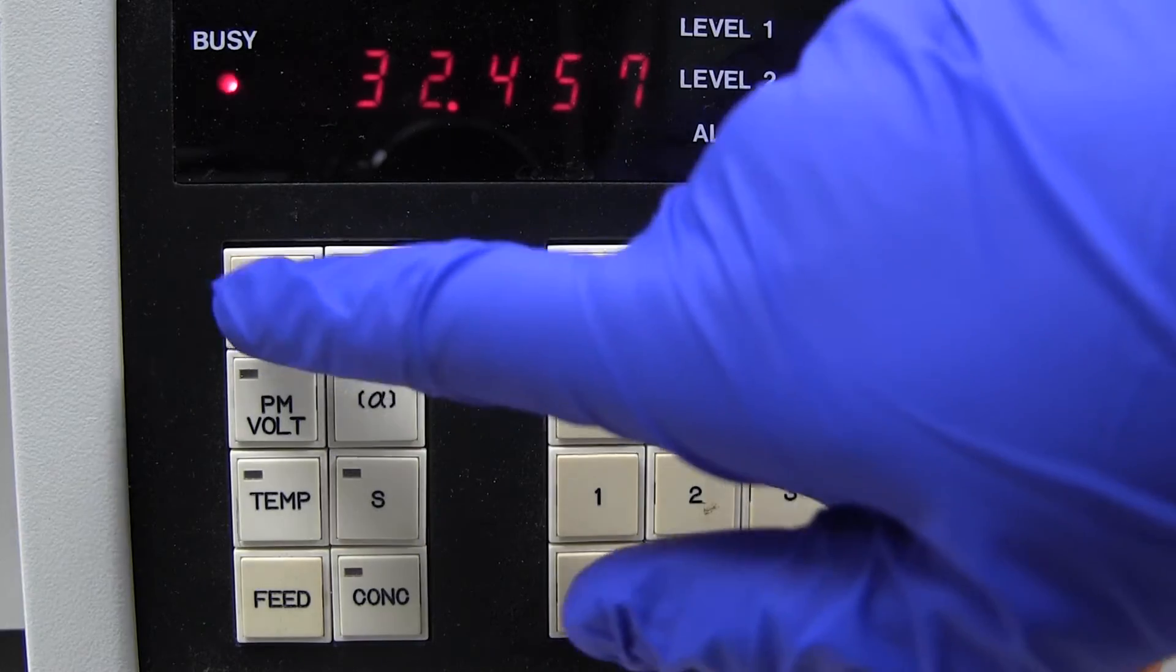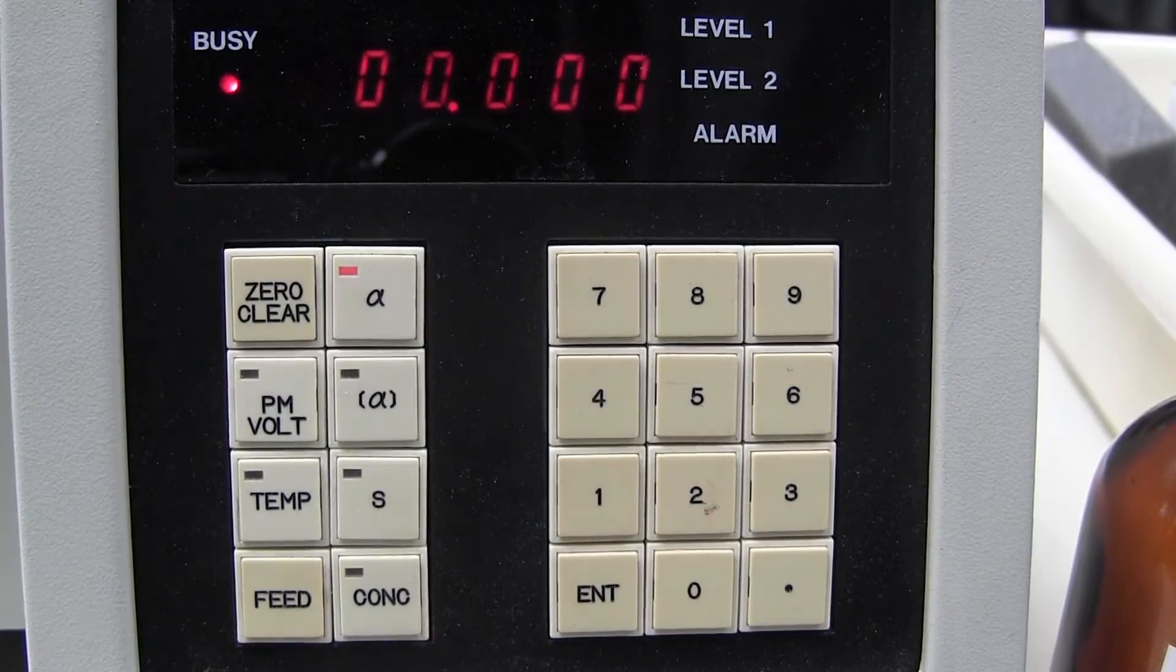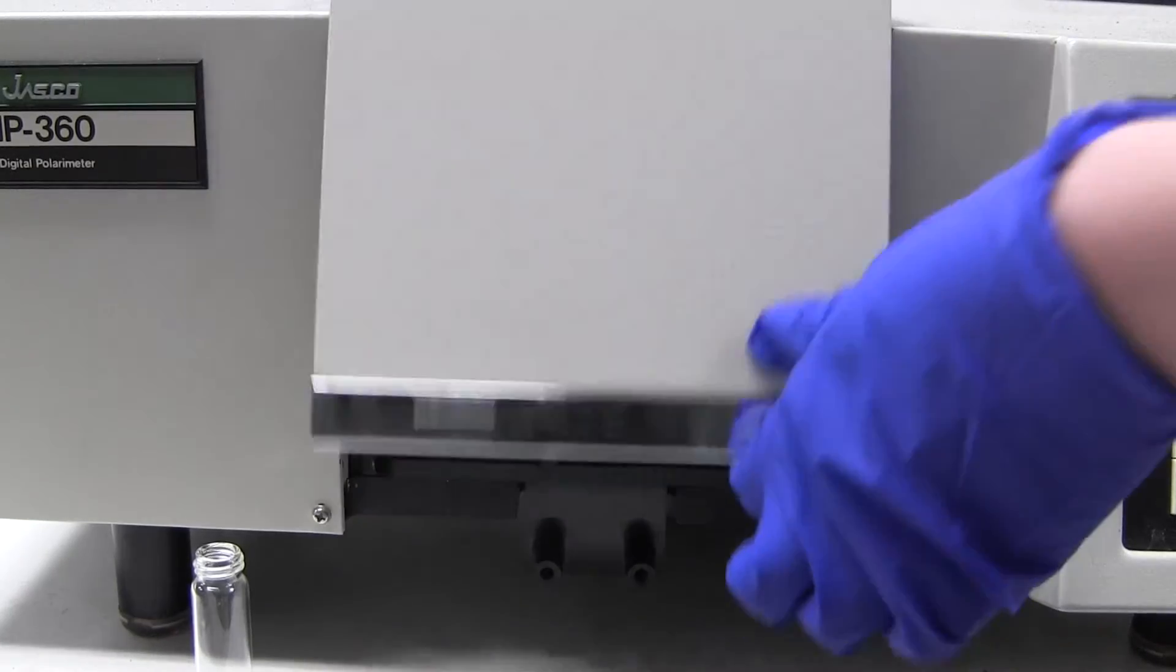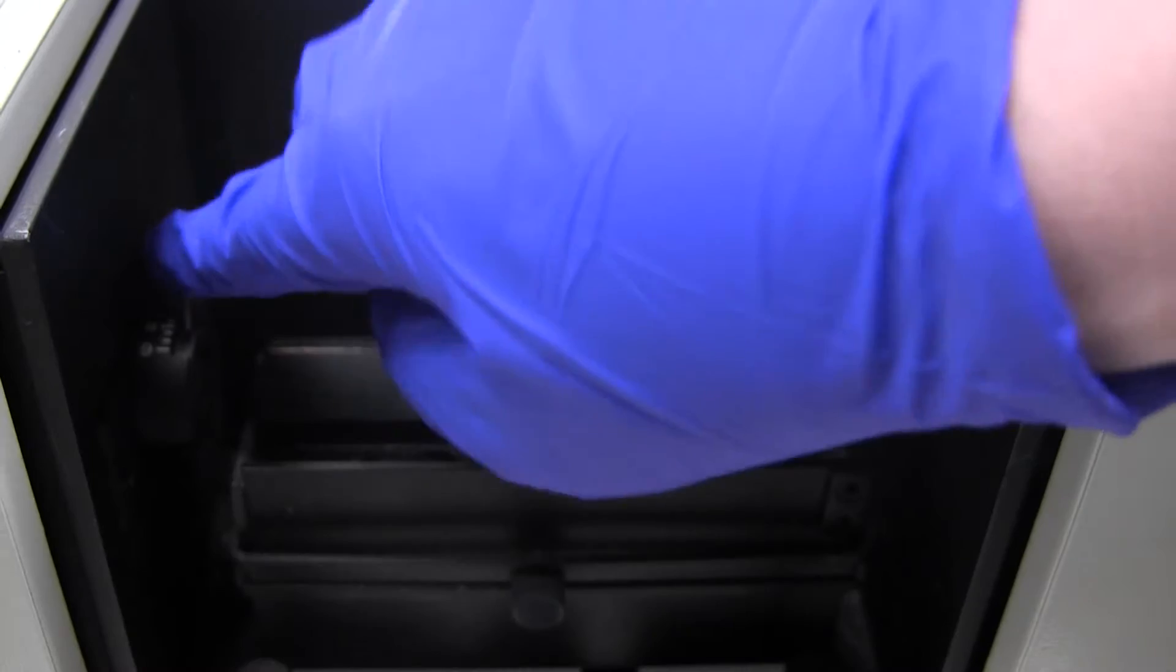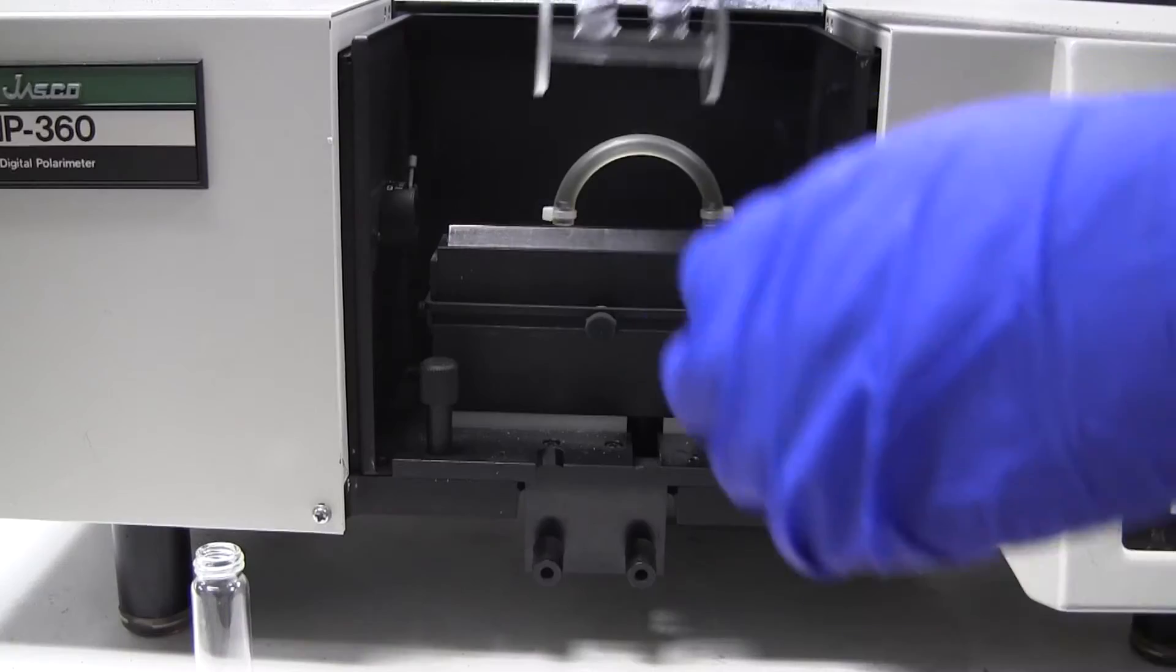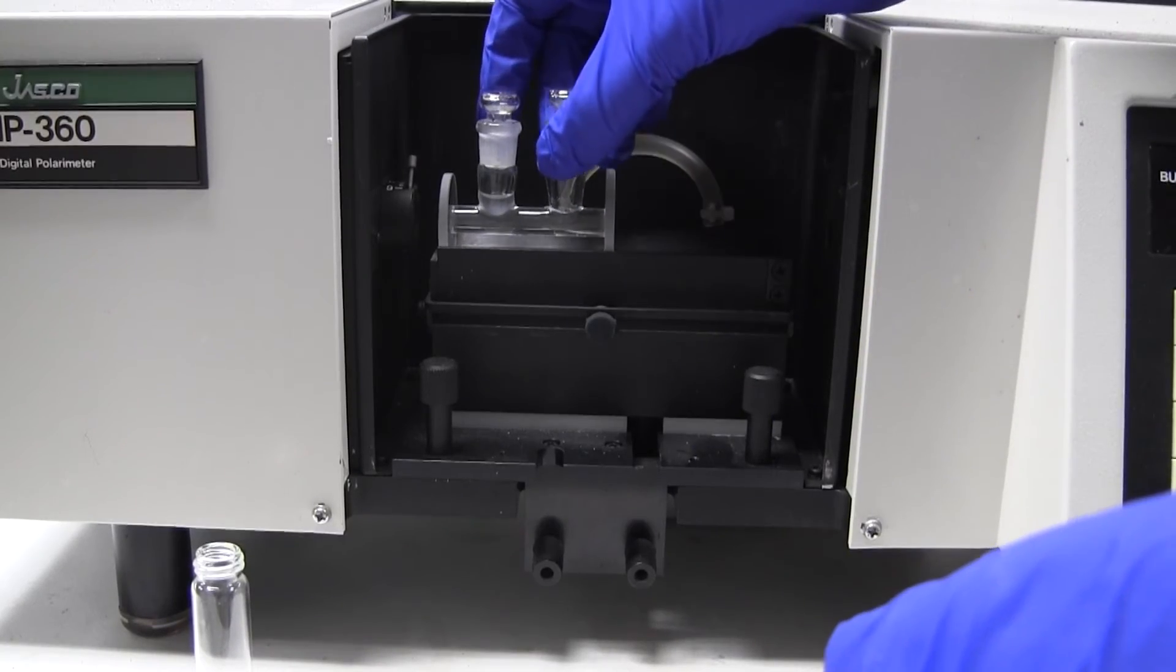Then press the zero/clear button on the instrument. Open the front compartment and make sure the slit adjustment is set to three. Place the cell into the instrument and slide it all of the way to the left.